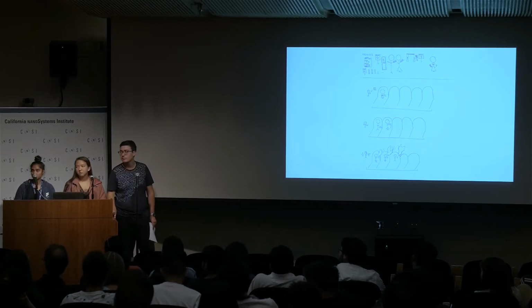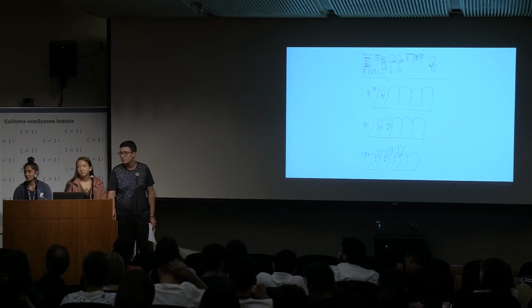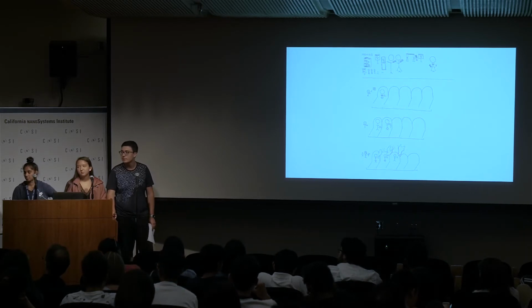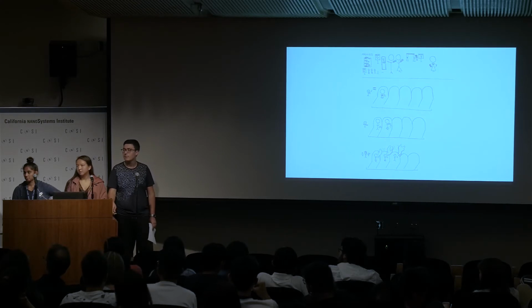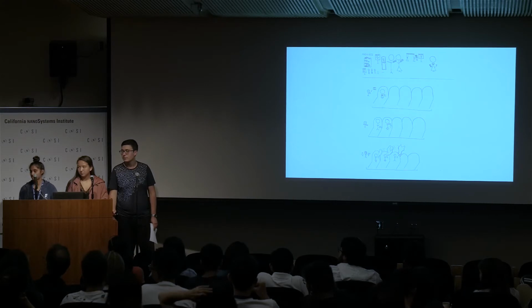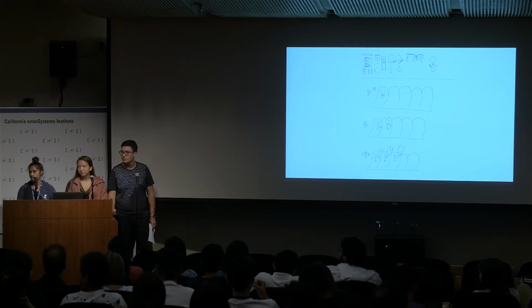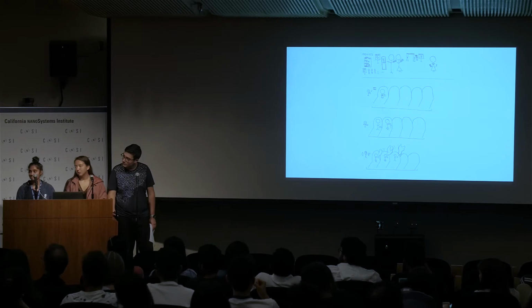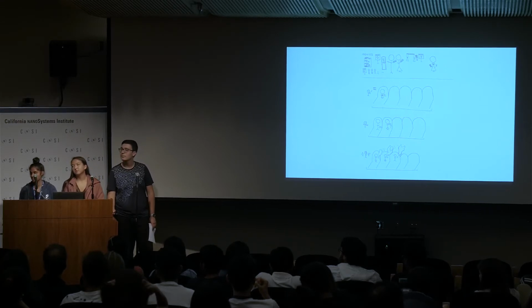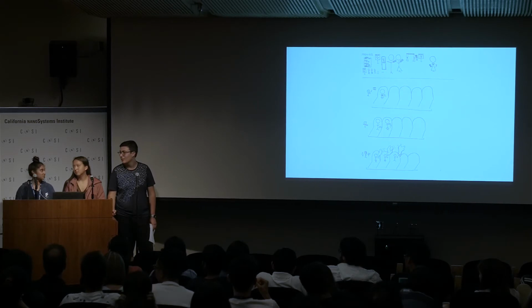So then to follow up, in the case of the bulk silver, it is doing some damage, right? Yes. But some groups actually saw that even with the bulk powder, the yeast maybe even seemed to do better. So why could that be the case? What's also happening as yeast cells are being killed? What are the yeast also doing? Or what might they be doing?